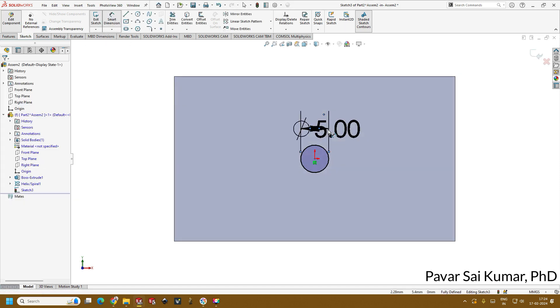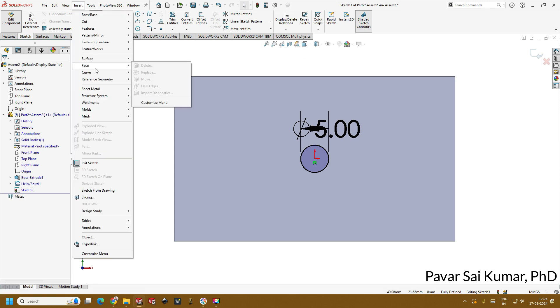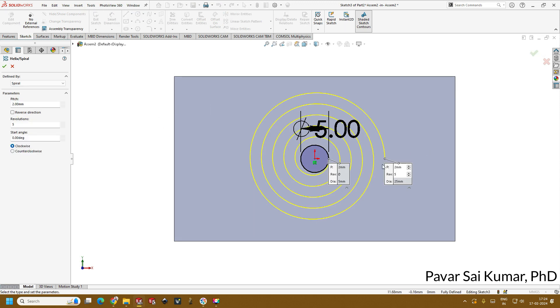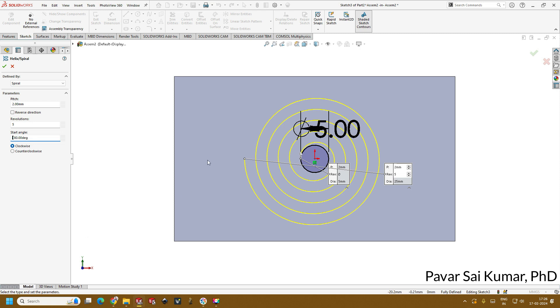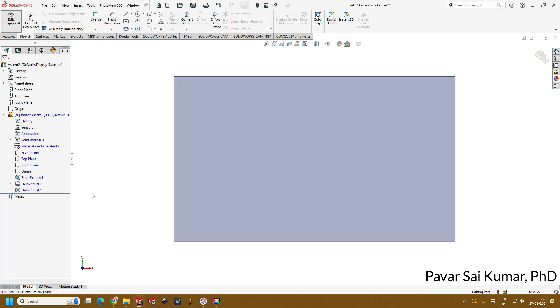This is our final first spiral. Now insert a second spiral. Notice that previously the outlet was facing one end; now we will use the start angle concept to shift it. If I shift the start angle to 180 degrees, you can see the outlet moves to the opposite end. So the start angle plays a crucial role when you want to create two spiral channels in a single microfluidic chip. Click OK. Now we have created two spirals.